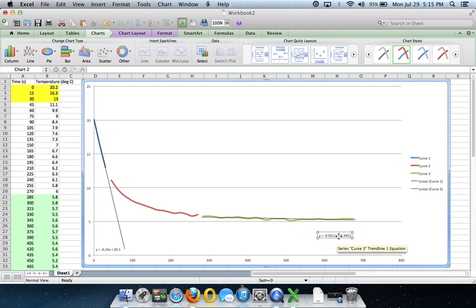When you solve for y, you're solving for the temperature, because that's the y coordinate, at which both this trend line and this trend line will equal one another. So once you solve the system of equations, that'll tell you what the actual freezing point was for this solution after adding the solute, which, if I eyeball it, is probably around 5, maybe 5.5 degrees.